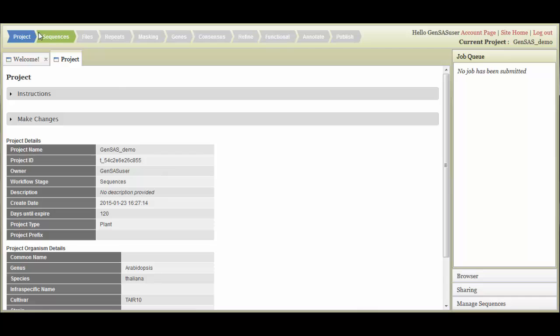You also will notice that the Sequences arrow is green, which means it is available for use in the annotation project.